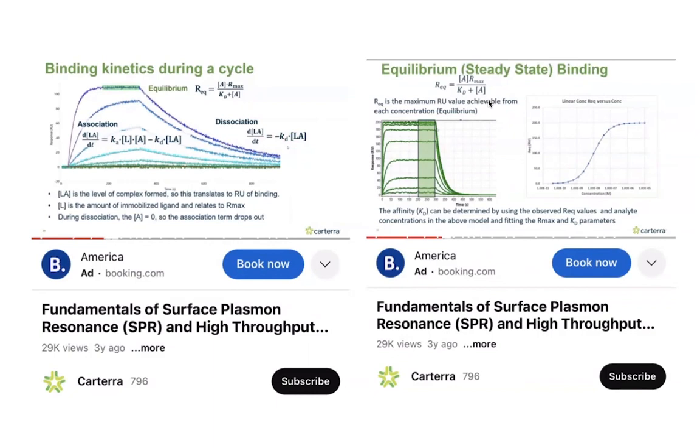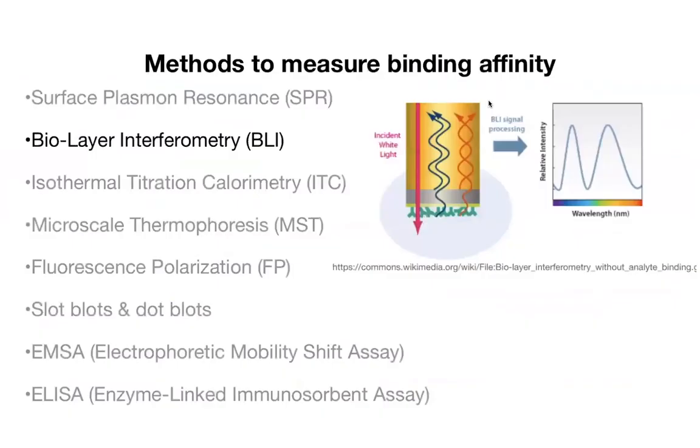So you can get all these sorts of different data, and this is the method of SPR. A similar method is Biolayer interferometry, or BLI. It uses the same principle: if things are bound to the surface of some sort of sensor, and then you shine light at that sensor, it's going to change how the light interacts with that surface and how the light's reflected.